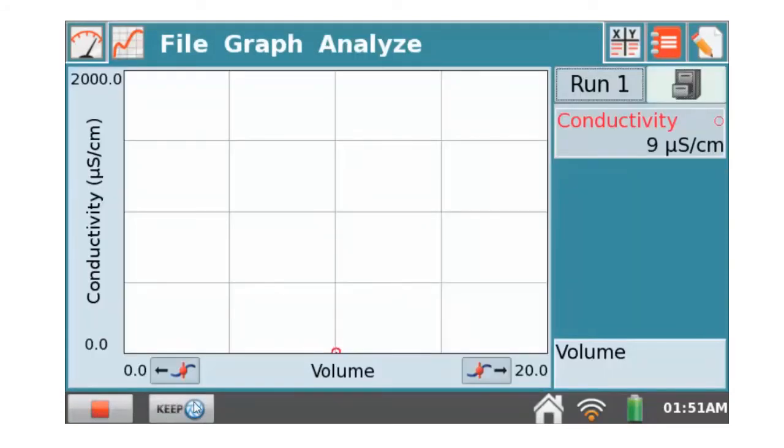When you hit the green start arrow at the bottom, lower left-hand corner, you're going to get this screen. That little keep button is what's going to be important for us. When you want to keep a point of data, when you've added some sulfuric acid, you want to keep that value, you'll click on the keep button. It will come back and ask you what you want to keep.